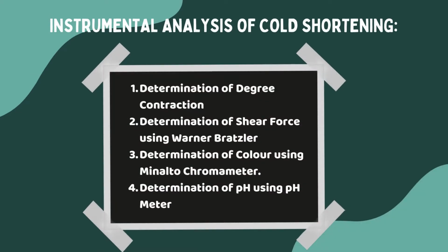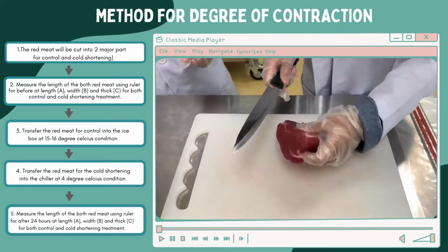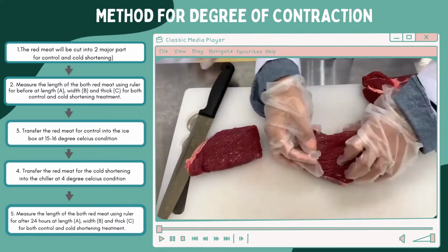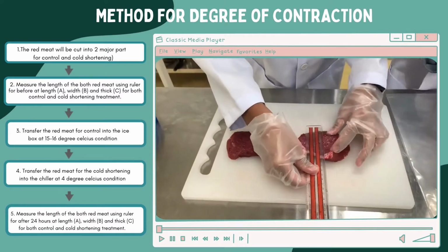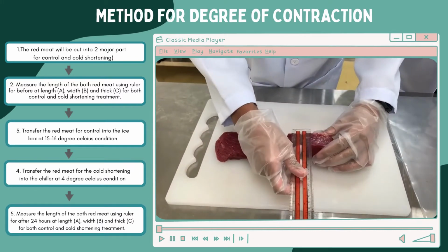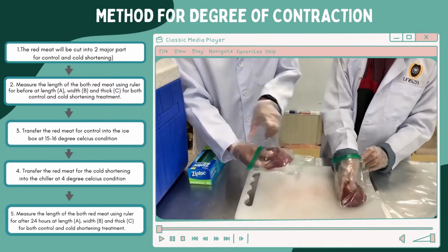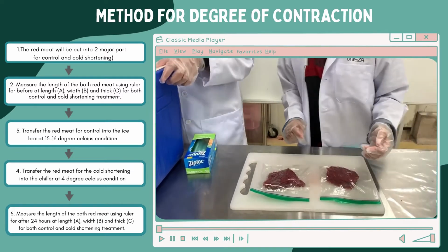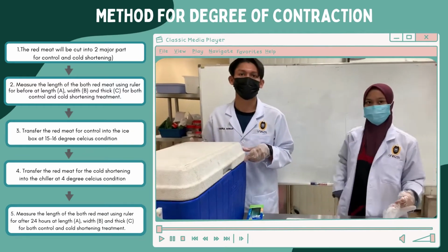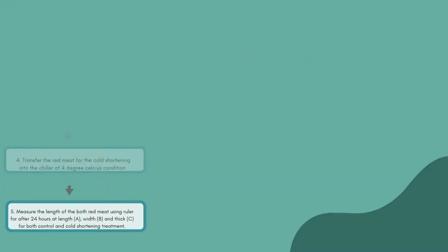Here are the instrumental analyses of cold shortening. Method for degree of contraction. The degree of contraction is measured by the length of the cut red meat for both control and cold shortening, before and after treatment, at 3 points: width, thick and length. The process will start off by cutting the red meat into 2 major parts. For the control, the meat will be placed in the 15 to 16 degrees Celsius condition. Meanwhile, for the cold shortening, it will be placed in the 4 degrees Celsius condition for 24 hours each.